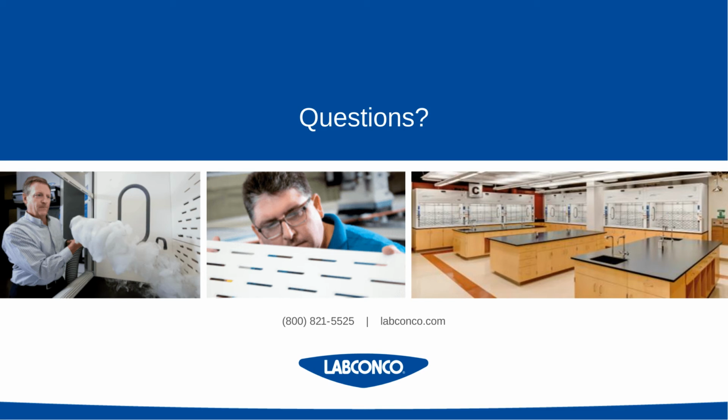Great, thank you so much, Kasey. So moving on to our next question. Did your cost of the ductless hoods include the filter costs? And do you know about the typical cost of these filters?